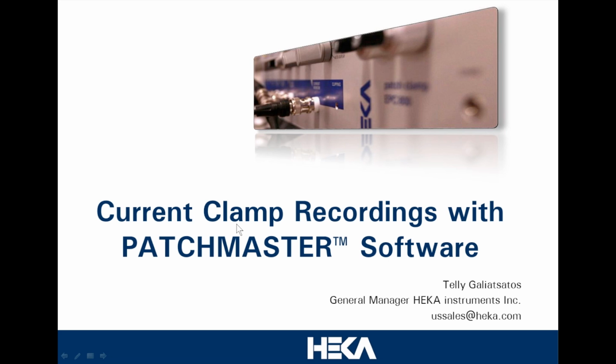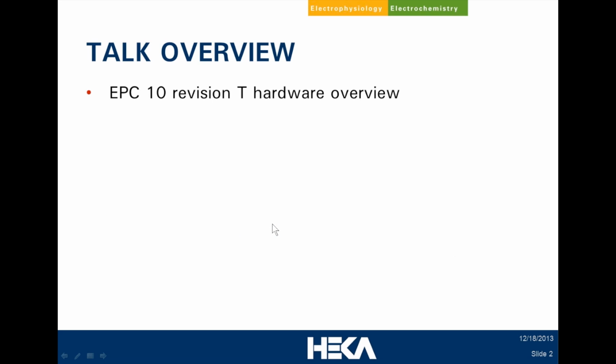Great, thank you very much. So, my talk will be all about current clamp recordings, on the software side of it. I will briefly discuss a few of the hardware features, in particular with the EPC10 revision T amplifier. So, today, first, we'll start off a little bit with the EPC10, in particular the revision T hardware overview.